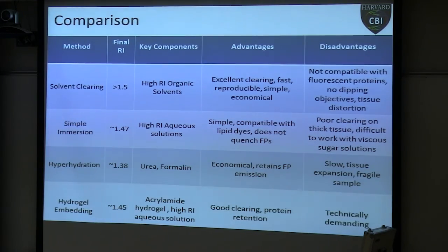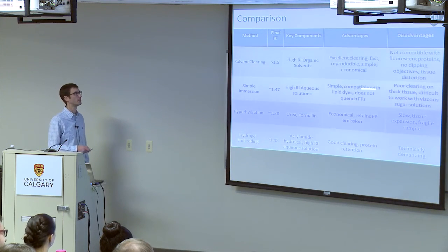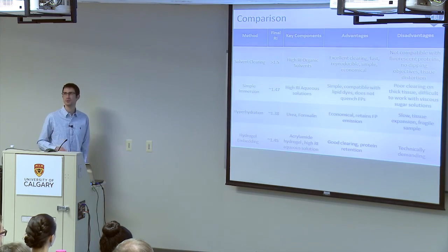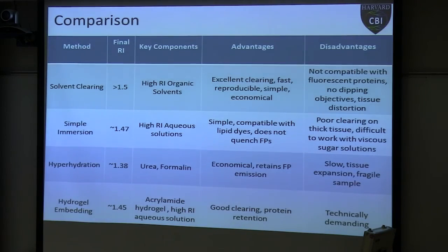Usually I don't recommend doing anything more than about 2 millimeters with one of these techniques, even though that's kind of pushing it. It's also pretty tough to work with these really viscous solutions that have a lot of sugar in them or a lot of glycerol.